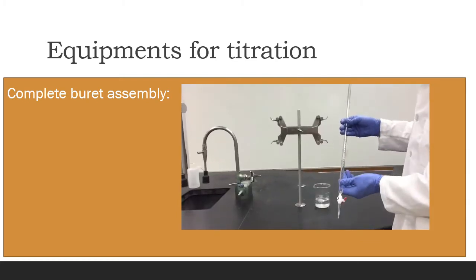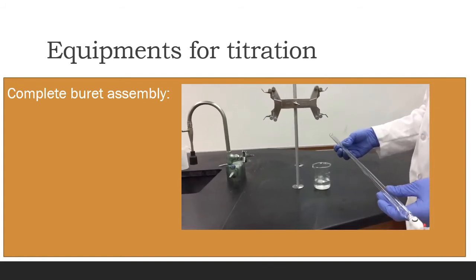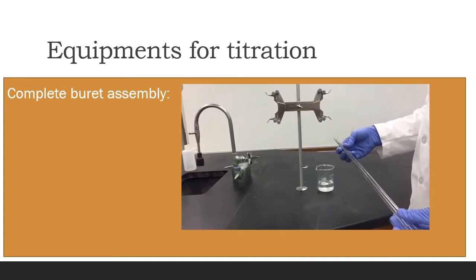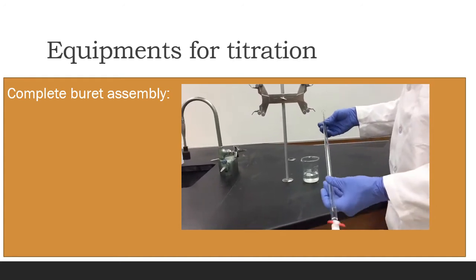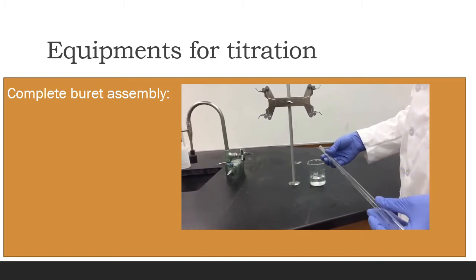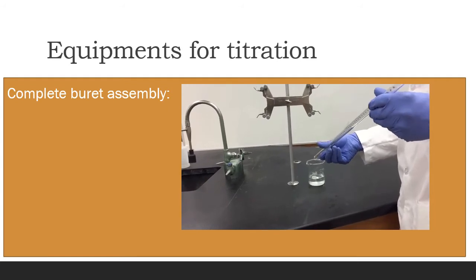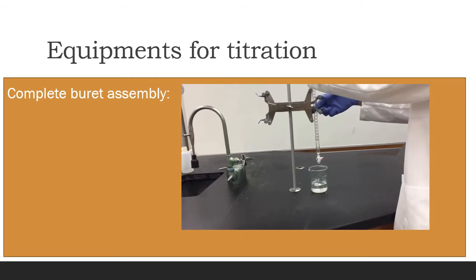With a few milliliters of titrant added to the burette, carefully take the burette out of the burette stand, turn it horizontally, and carefully turn the burette in your fingers to fully coat the burette with the few milliliters of titrant. Once coated, you can pour out the excess titrant into a waste beaker. Place the burette back into the burette stand and get ready to fill the burette with titrant.